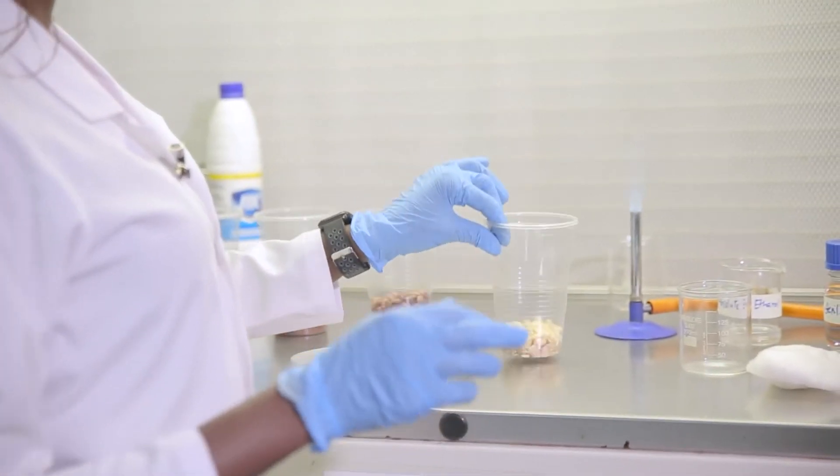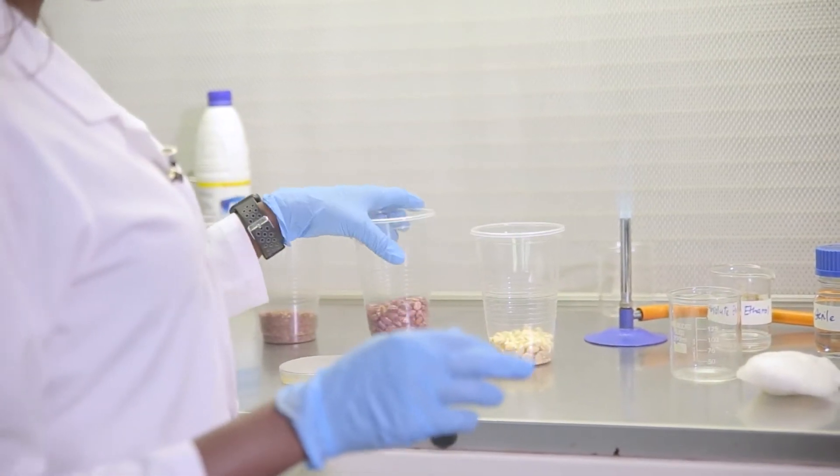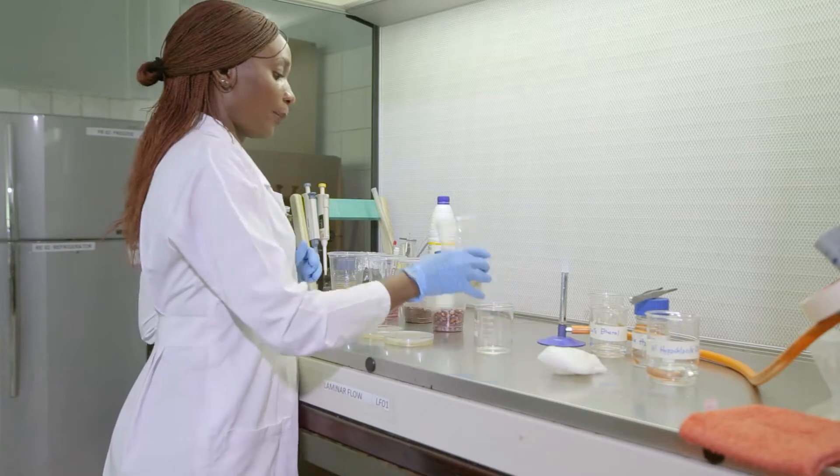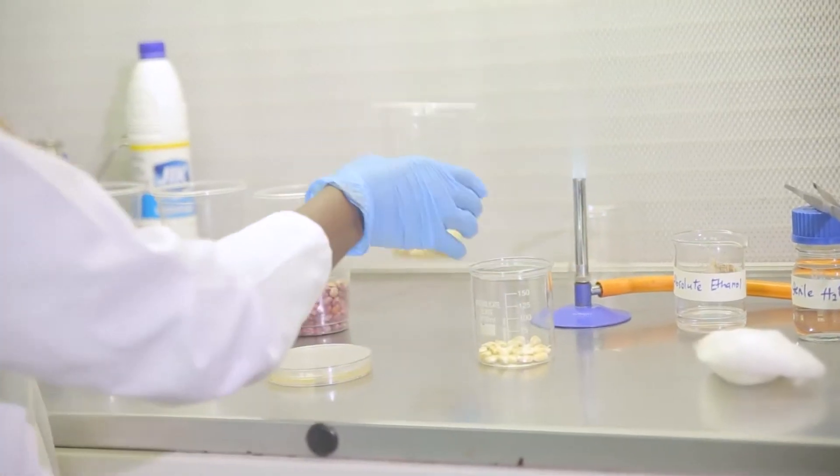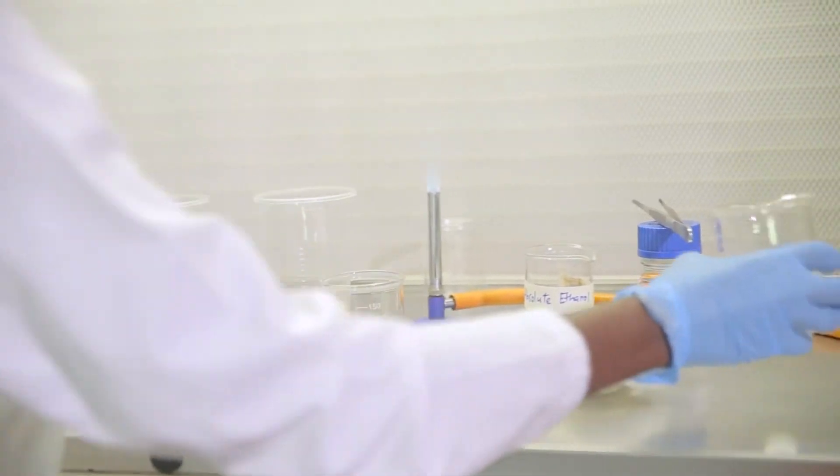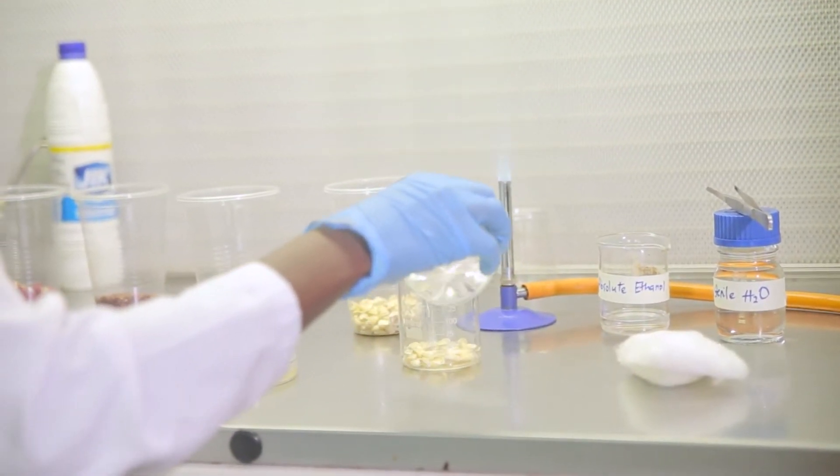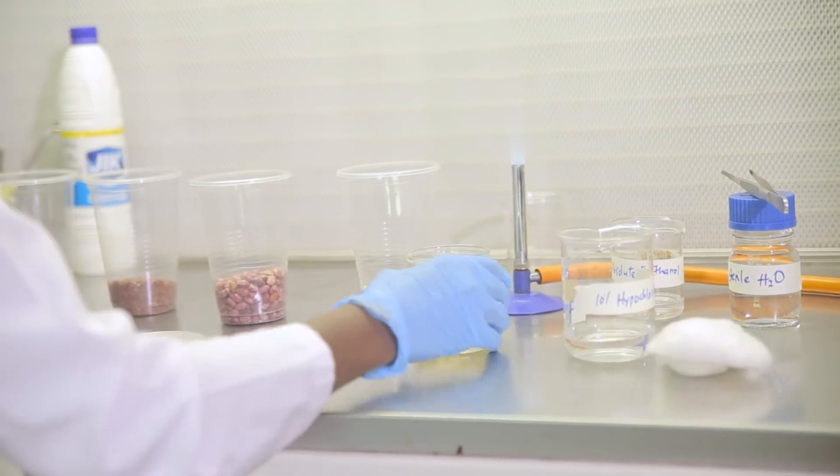So I'll demonstrate with the corn and maybe I'll also use the beans. We pour a few seeds into the beaker. They could be 10 to 20 seeds, and I'm going to cover them with the 10% hypochlorite.